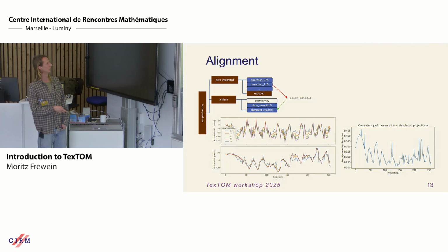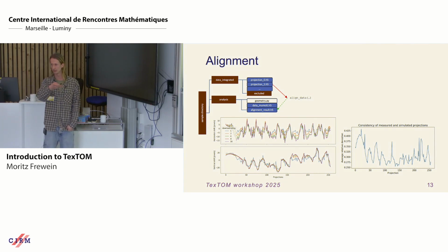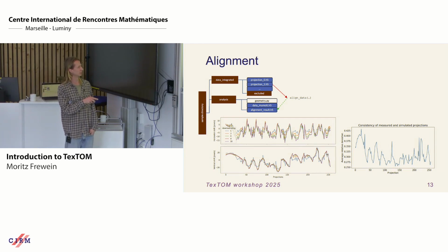Yeah, one comment on the downsampling, because, as I said, the code is for sub-pixel alignment, so we downsample the data by regrouping pixels and then optimizing that, then taking the higher sampling until we get to the actual sampling, and then we get out these shifts, horizontally and vertically, and you can see that the lowest sampling is quite a simple curve, and then it gets finer details with the higher sampling.